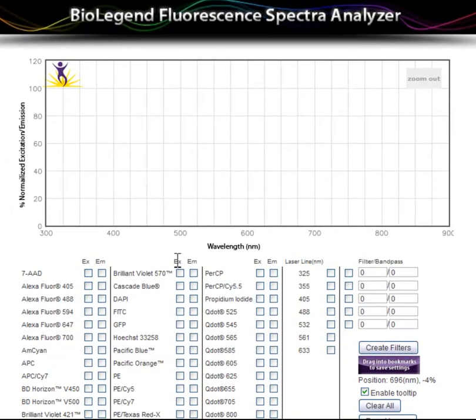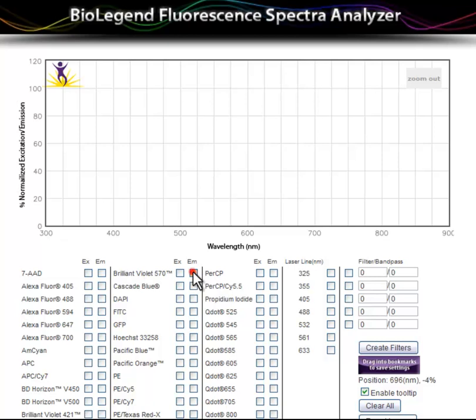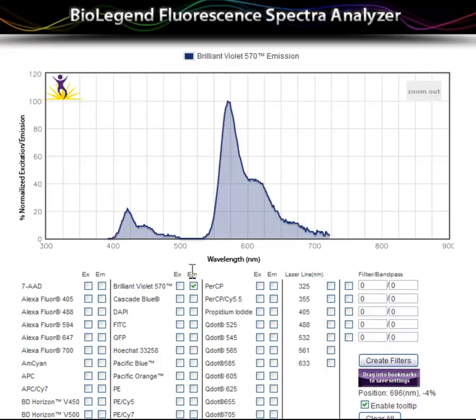To view the emission or excitation of any fluorophore listed, click the checkbox to select or deselect the desired fluorophore.